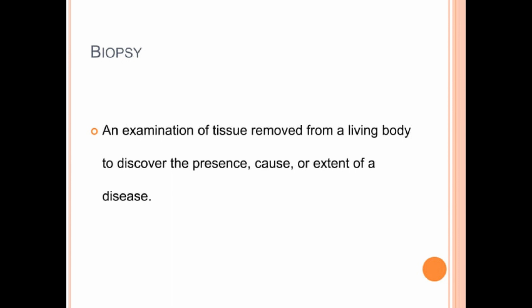What is a biopsy? A biopsy is the procedure of extracting a small piece of tissue from a living organism to study it under the microscope. This tissue sample is usually taken from areas where abnormalities are suspected, such as a lump or lesion. For example, if a patient has a suspicious lump, a doctor might perform a biopsy to determine whether it's cancerous. In histopathology, biopsies are processed to prepare thin sections that can be examined microscopically for abnormalities.